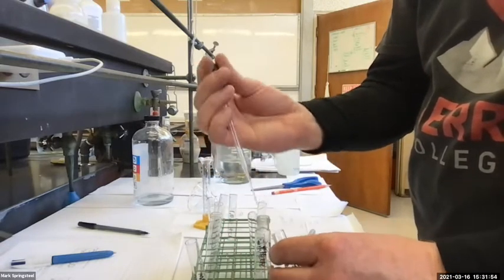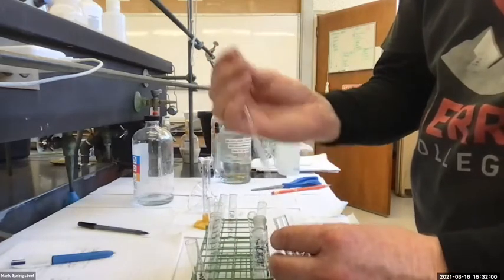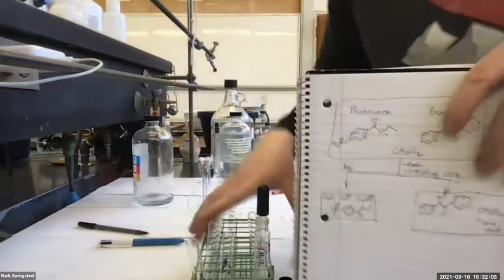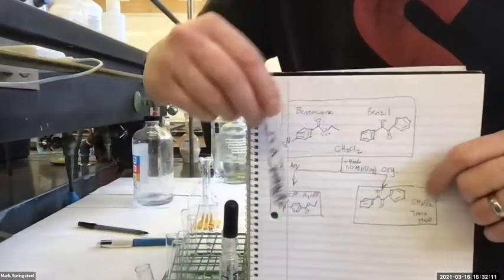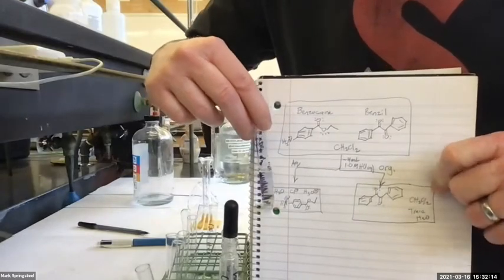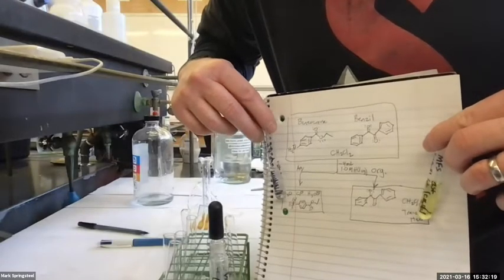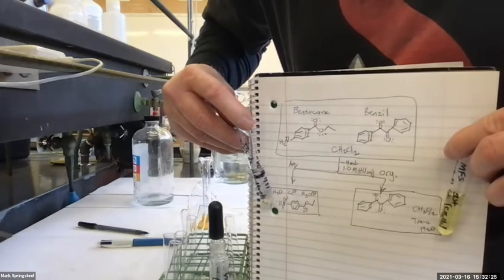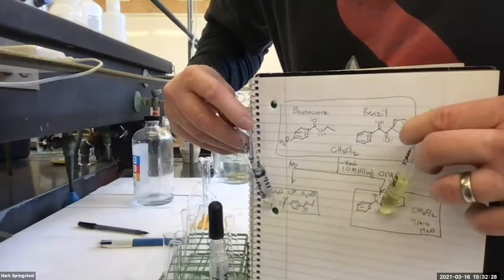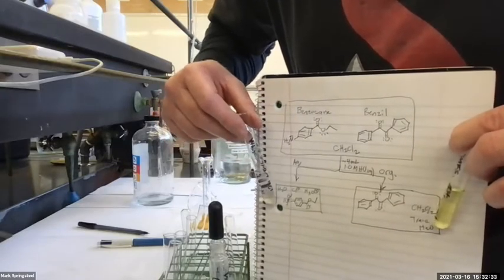Oh, did it work out nice in terms of color? I'll show you the extraction diagram first. So this is my aqueous layer, and that's what I predict is in there, right? And this is my organic layer. Is there something that's suggesting it's going well to you visually? Yeah, the color. Benzil is yellow. Looks like it's in the yellow organic layer. And this is white. When it dissolves, it's just clear.